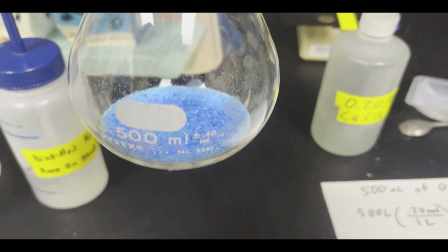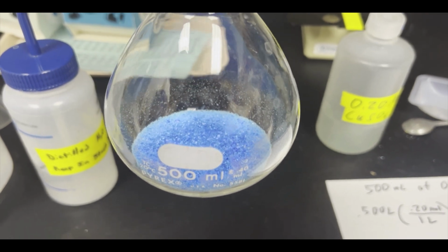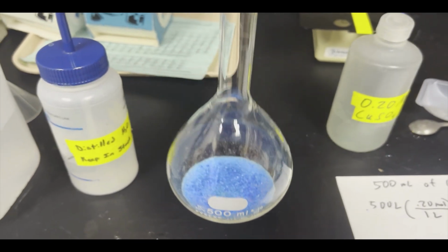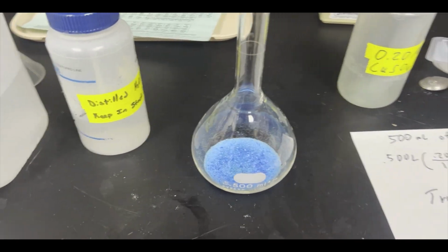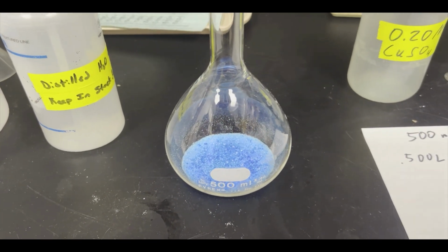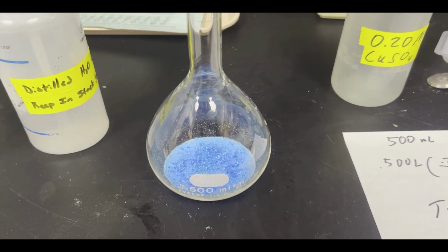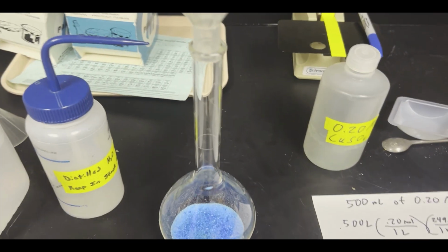So I'm just going to dump that in using my funnel, and now we have our copper sulfate at the bottom there. Now, that solid takes up space, so we need to account for that. But it takes up a different amount of space than when we dissolve it. So this is why we need to use a volumetric procedure, because the space a solid takes up is not the same as the space it takes up once it's actually been dissolved and the ions break apart and it intermixes with the solution. There's actually a difference there, okay?